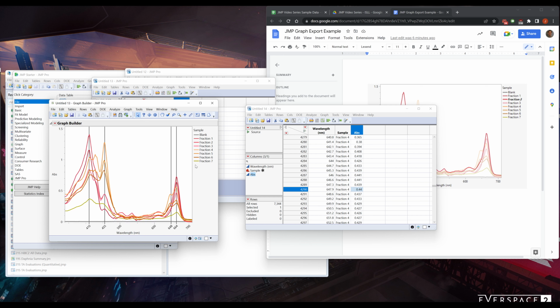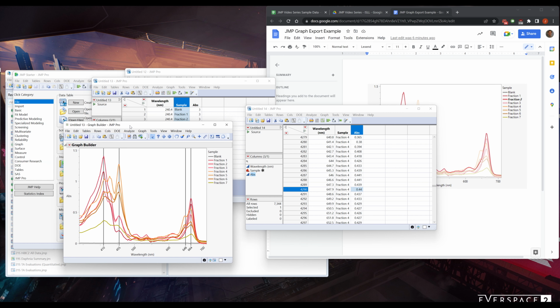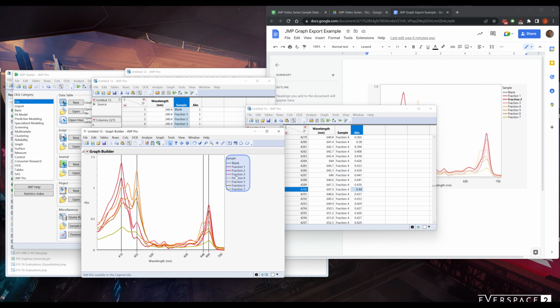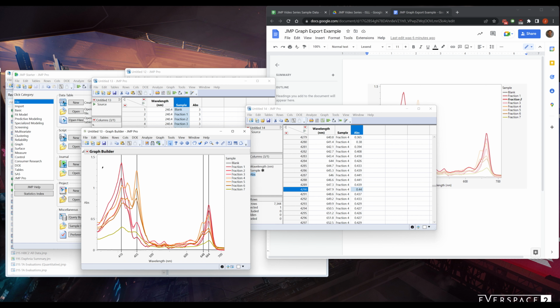So use this to look forward to during your plant pigments extraction. Hopefully you'll see something better than this. Not as troubleshooty. I was collecting fractions. You guys will have a goal. But this is my current preferred way of making the spectra, doing that multi-series stack and then working from there. It's much easier to work with them as this overlay rather than trying to plot a bazillion of them on the same axes.